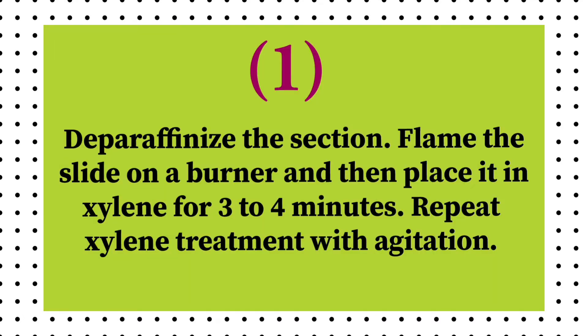Firstly, deparaffinize the section. Flame the slide on a burner and then place it in xylene for 3 to 4 minutes. Repeat xylene treatment with agitation.